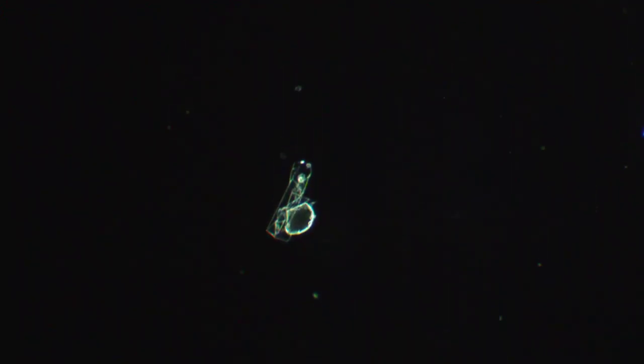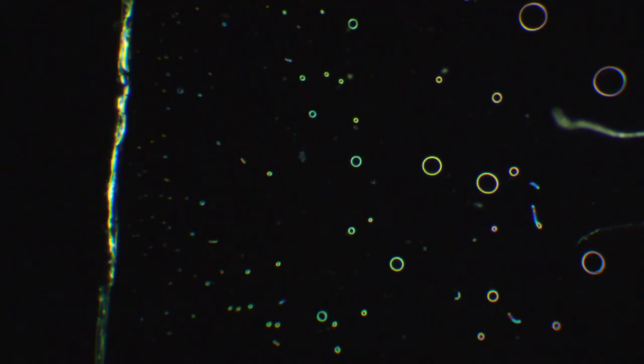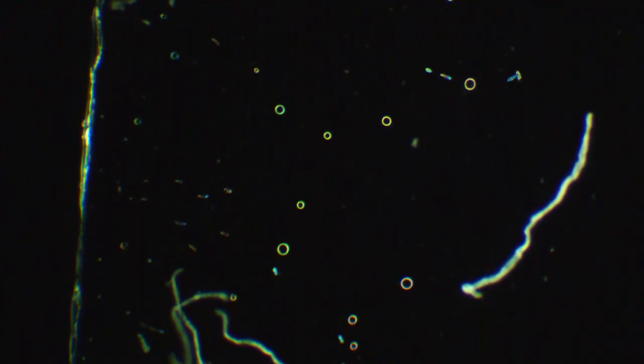Going back out to the second objective now, and back out to the first. I want to see what else is in this sample. We lose some detail from the stream. Well, at least now I can go in tighter on these guys. YouTube should be streaming out at 1080, 60 frames a second. These are little bubbles we're seeing. On Periscope, it's about half of that, 960 by 540. That looks neat. Oh, here we go. Here's something. What are you?